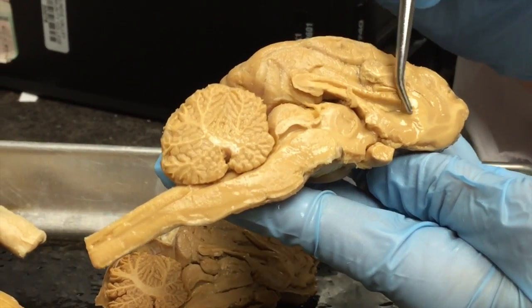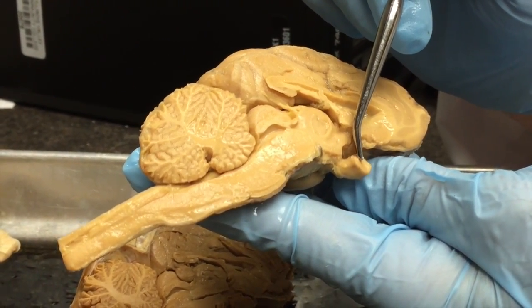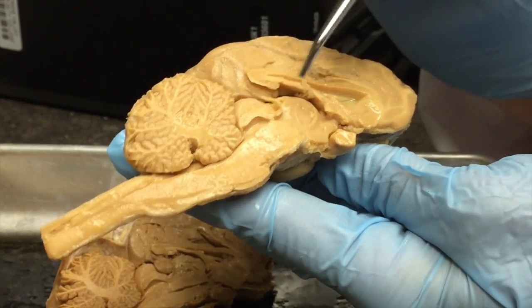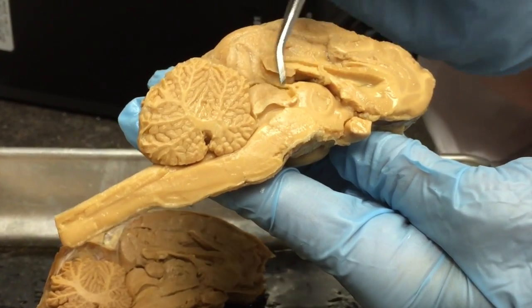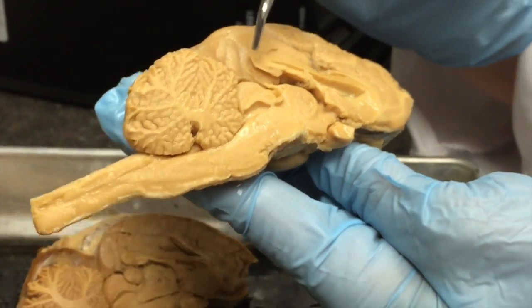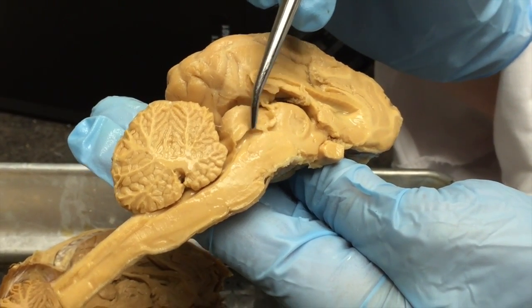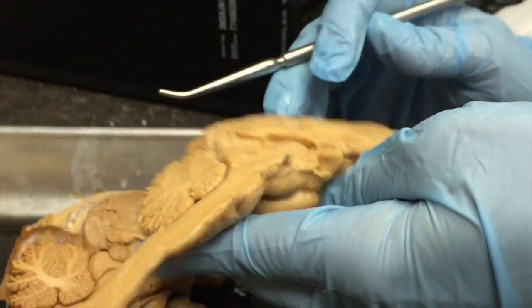When you're looking at a mid-sagittal view, the other thing that you want to take note of is the optic chiasm has been cut. This is where the pituitary would have been, and this is where your mammillary body would be. Now, this shows the cerebral aqueduct because this cut of the brain was right along the midline. So here's your cerebral aqueduct, and you can see the superior colliculus here and the inferior colliculus right along here. Okay, so I think that looks good.